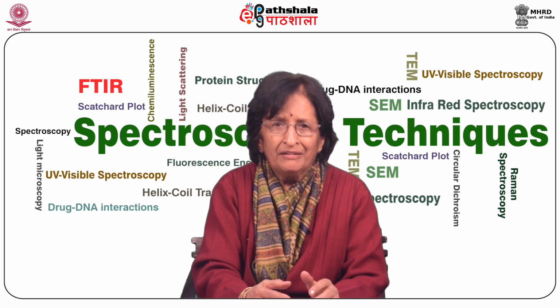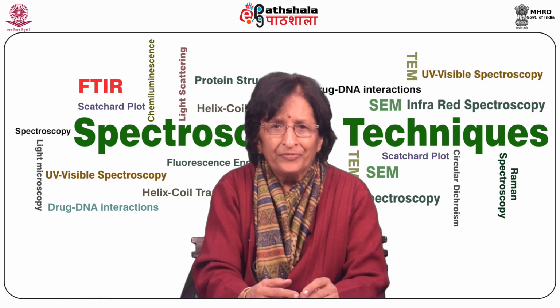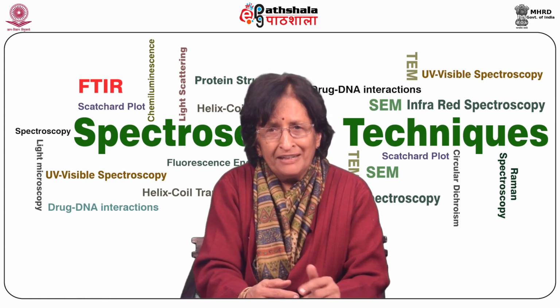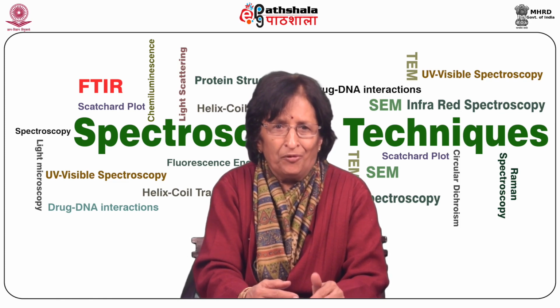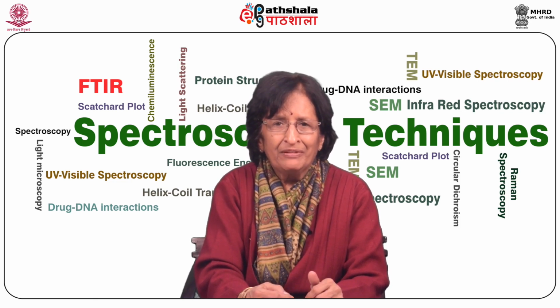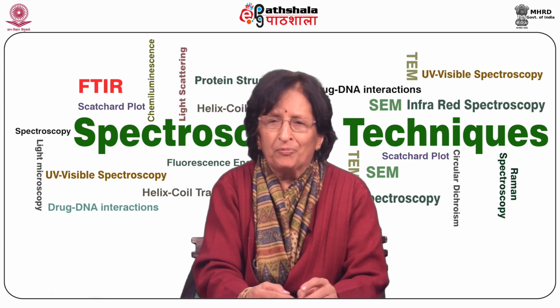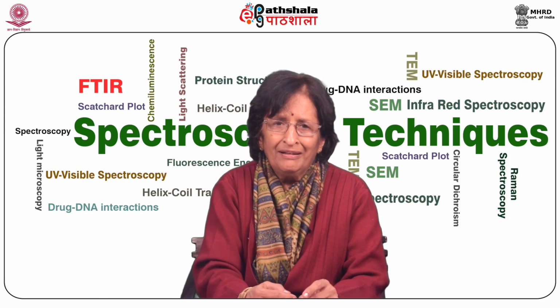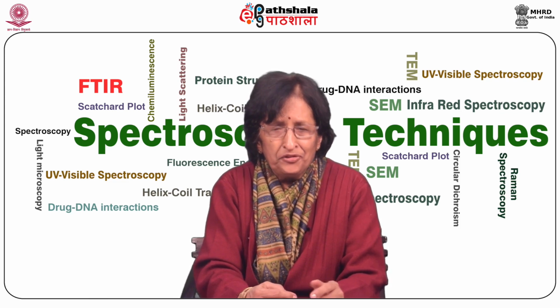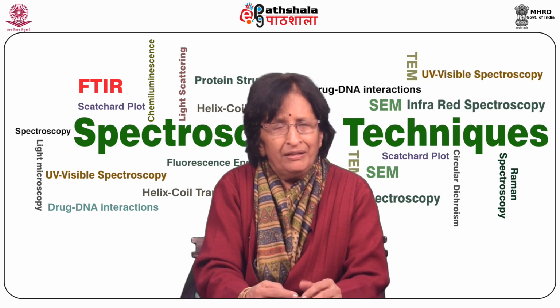The constant of proportionality is called the absorptivity coefficient. If the concentration is expressed in moles per liter and cell size in centimeters, the absorptivity is called the molar absorptivity or molecular extinction coefficient, and is given a new symbol, epsilon. The absorptivity is wavelength dependent.